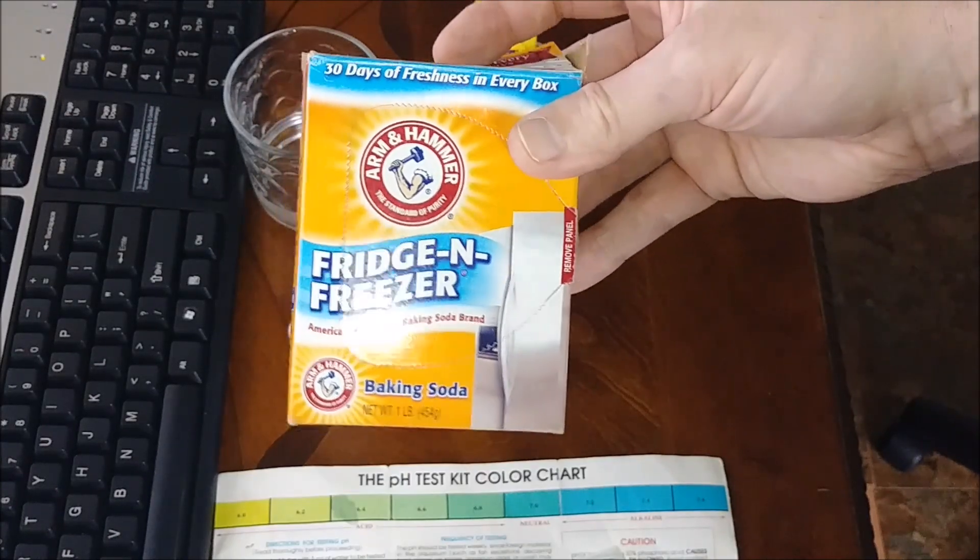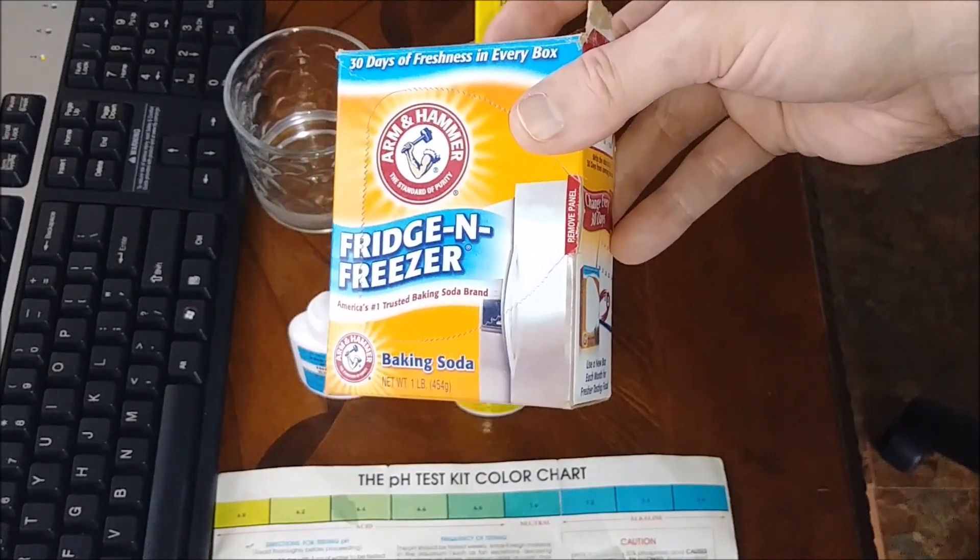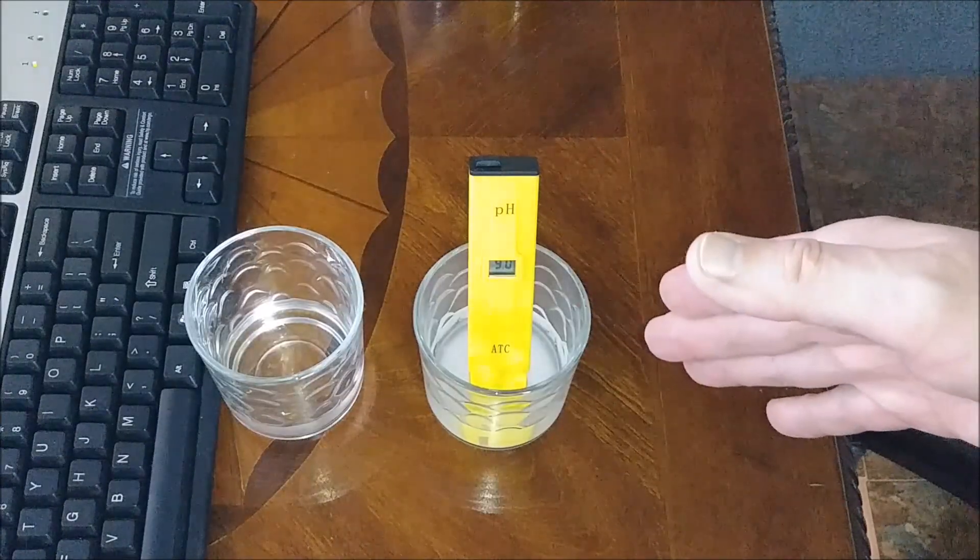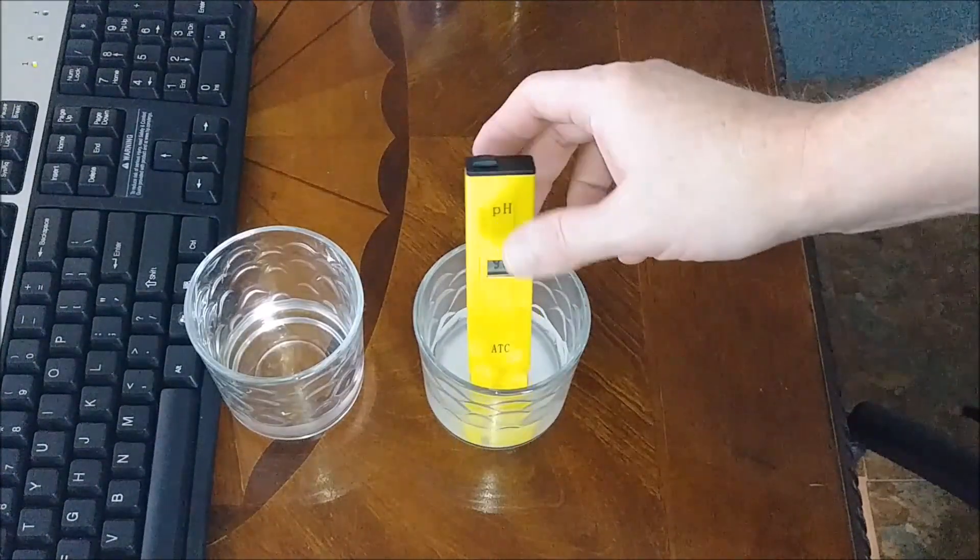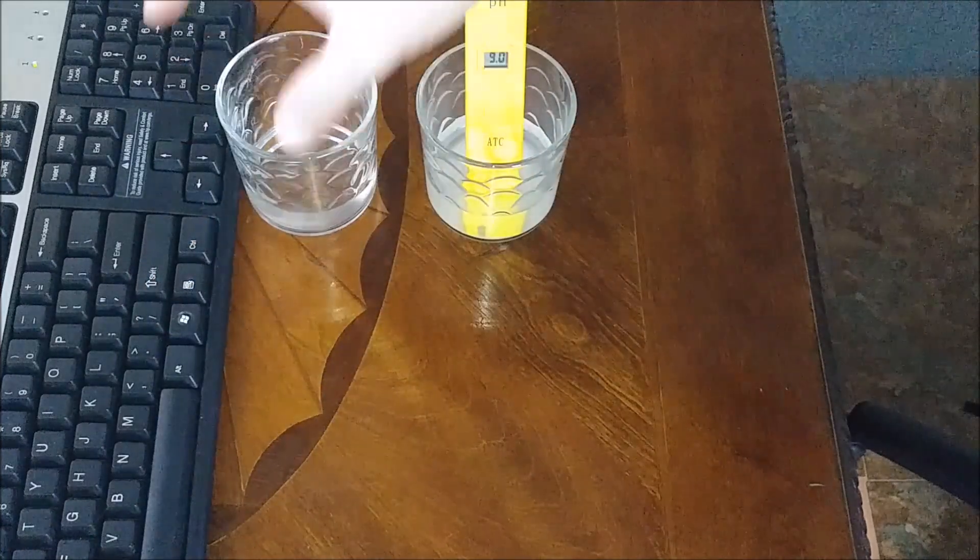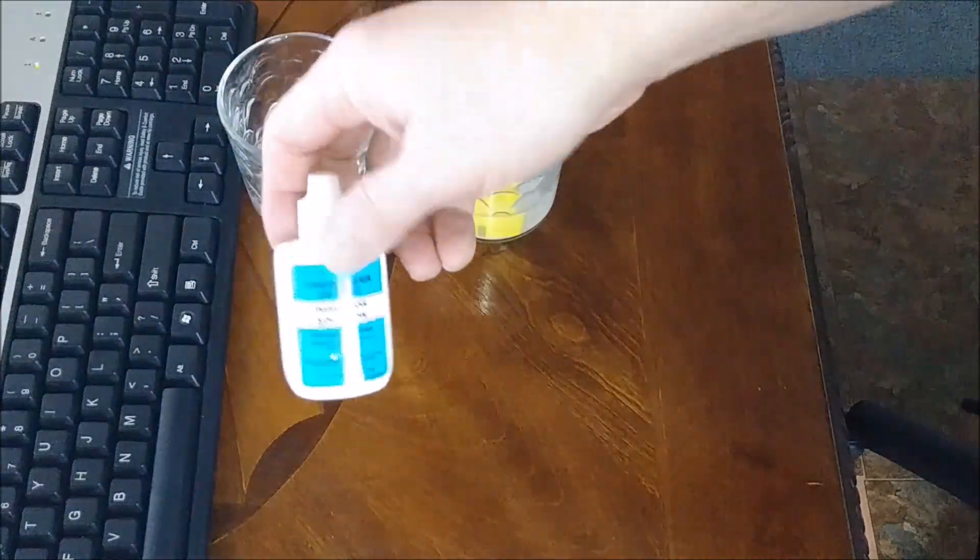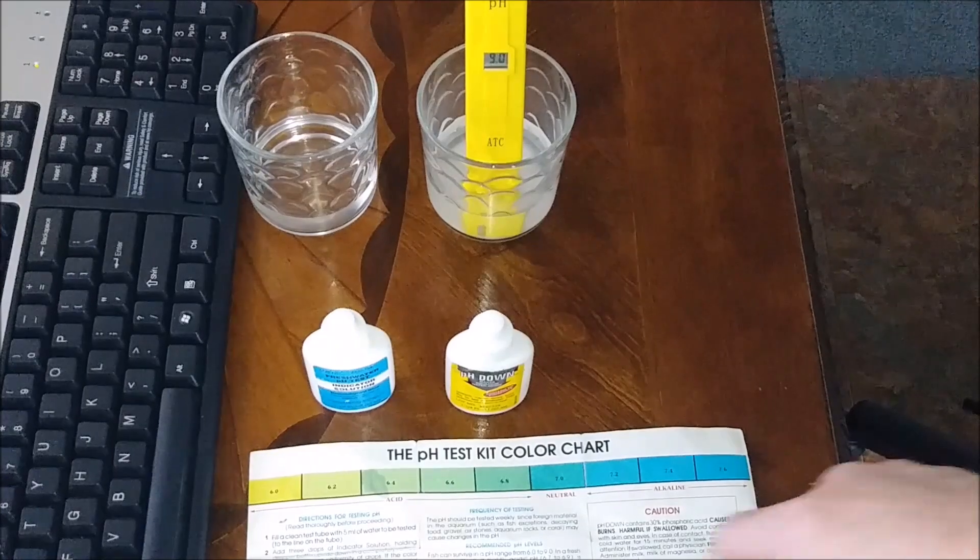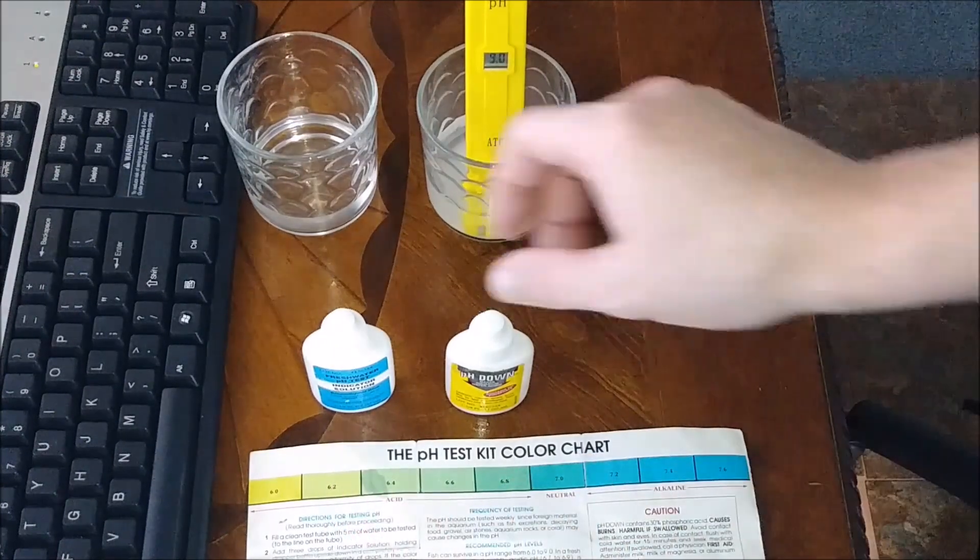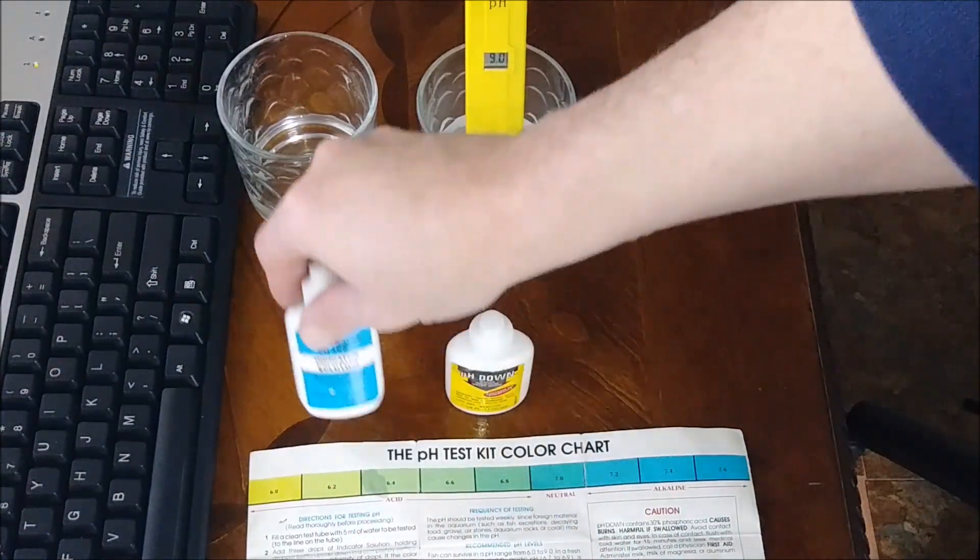It's another way of checking your pH on your tester. You can always do the old-fashioned way with the aquarium test kits to double-check, and you can check your pH by using a pH indicator with your test tube. These are pretty cheap; you can pick them up.